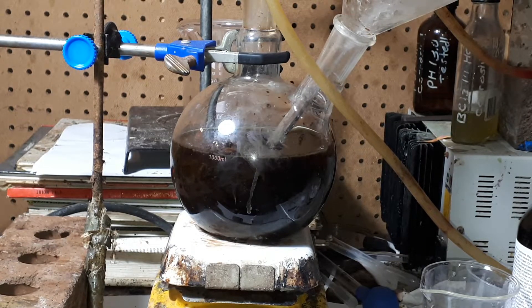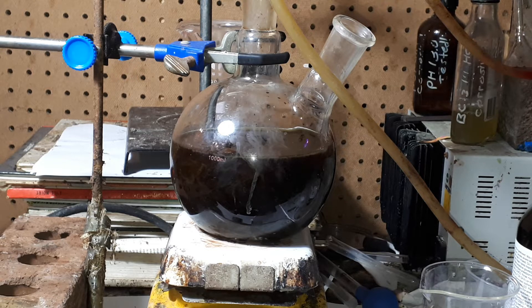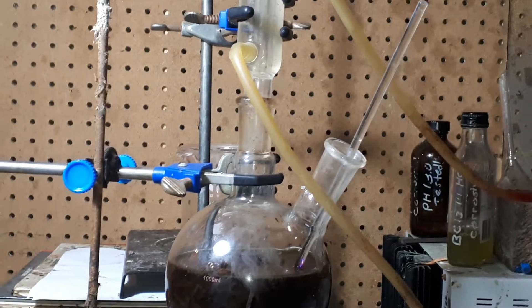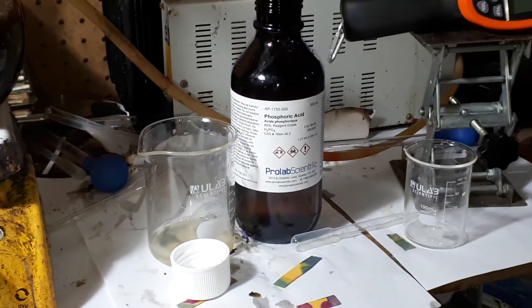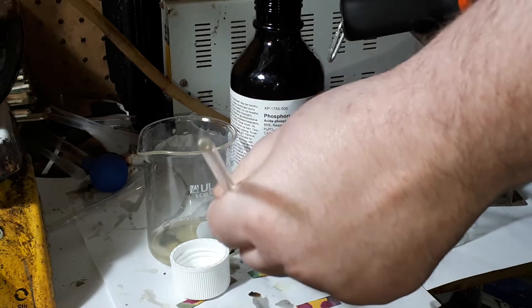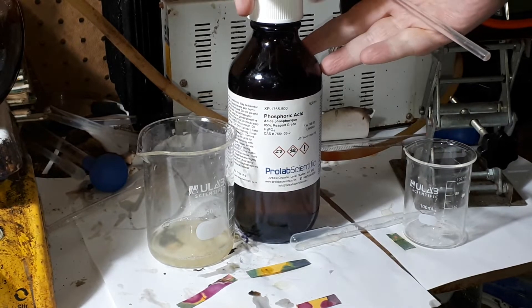That should work for now. Now we're going to take off this glass funnel and test the pH of the solution. The pH is yellow, meaning it's around 6, so it's slightly acidic.